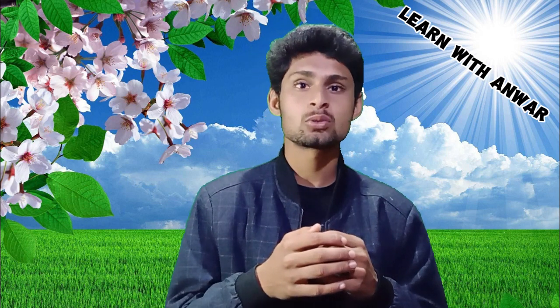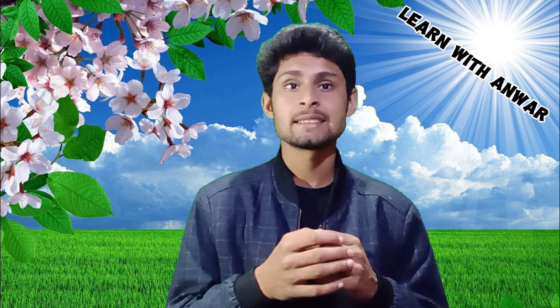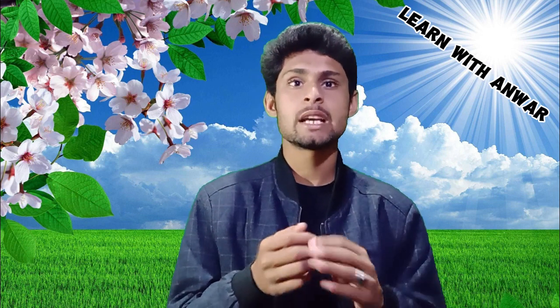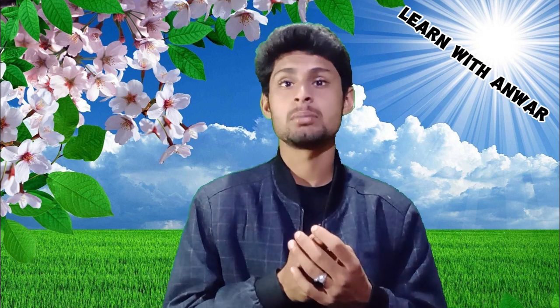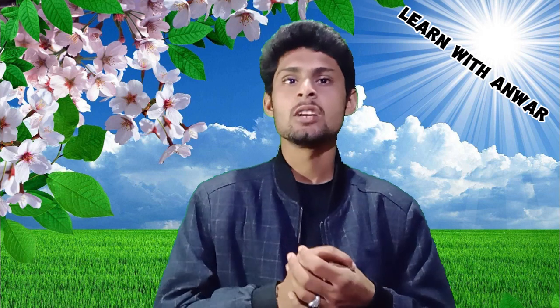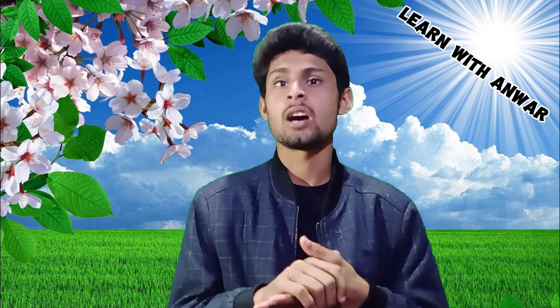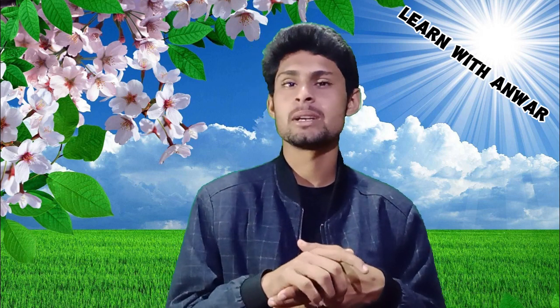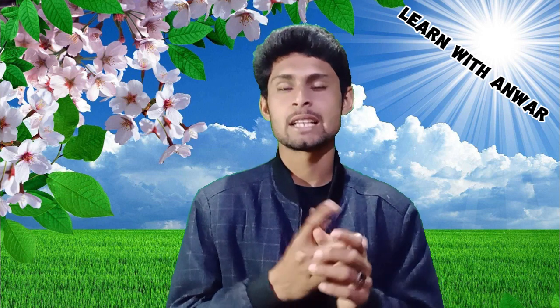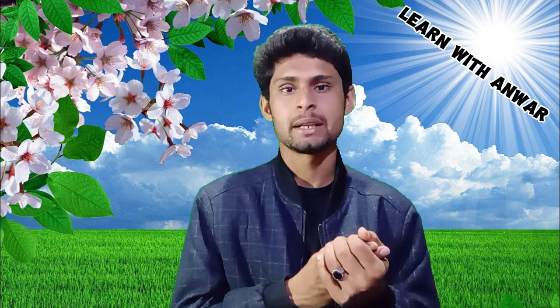There are also microscopes that use lasers, sound or X-rays. The scanning tunneling microscope (STM) can create images of atoms, and the environmental scanning electron microscope (ESEM) generates images using electrons on specimens in a gaseous environment. These use other physical effects that further extend the types of objects that can be examined.